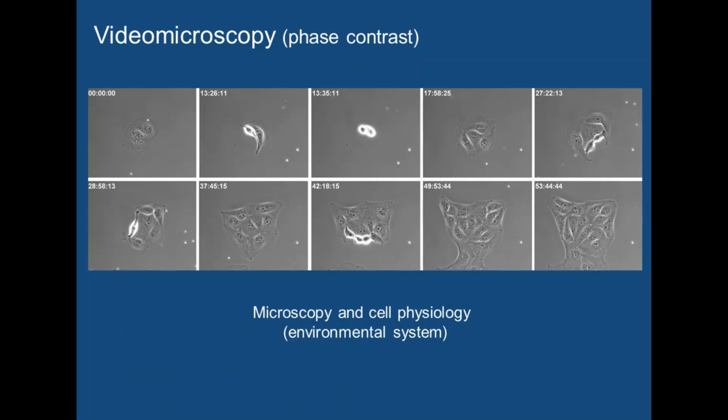As time went on, we switched to doing video microscopy, where we could continually follow these things with at first a video camera and then a digital camera. This is phase contrast microscopy showing two individual cells growing. These are mammalian cells over a period of 50 some odd hours, going through multiple division cycles. We can visualize that. We see the timing between cycles of mitosis and then growth. This is also a very powerful technique that we've used for a long time.